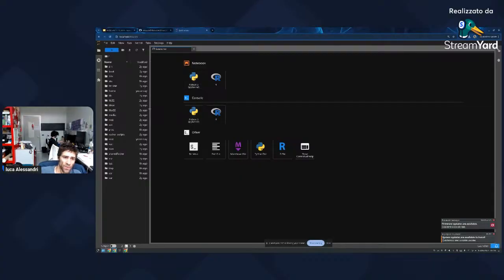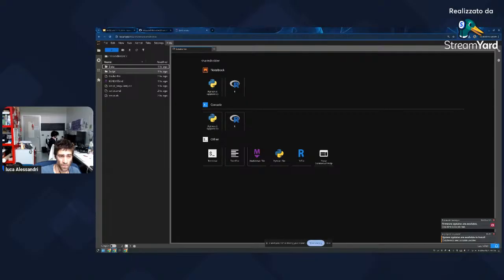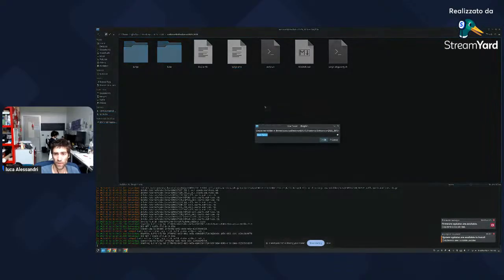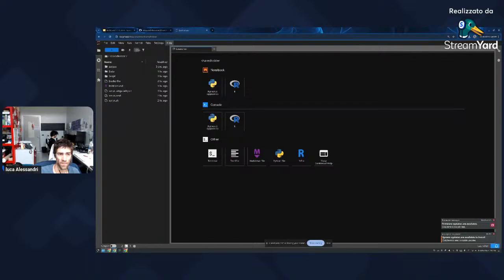In working with this environment that I set up, you can see that to the left you have a folder called shared folder. Well, this folder is the tunnel that connects your Docker, your virtual machine, with your computer. Indeed, if I create a new folder over here, it is going to pop out here.